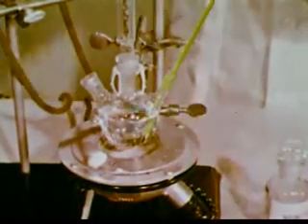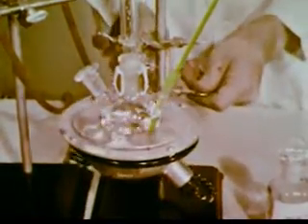We add a boiling chip to the reaction vessel and prepare to distill the contents. We distill through a column filled with a metal packing, and find that a constant temperature of 63 degrees centigrade is reached.